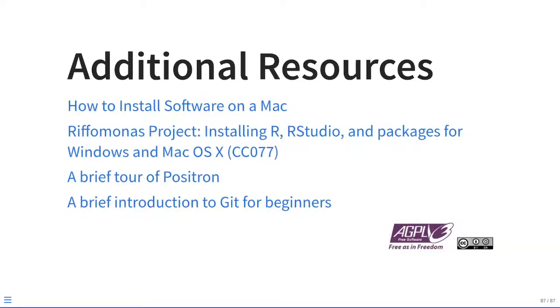And with that, there's additional resources, specifically how to install software on a Mac. I like to include several videos just for those of you who don't particularly enjoy reading and prefer more listening to the how to do it and visualize it. There's also a brief tour of Positron as well as a brief tour of Intro to Git for beginners. These are both useful, but we also will revisit these topics later on.